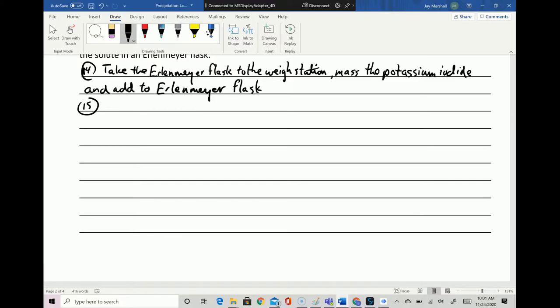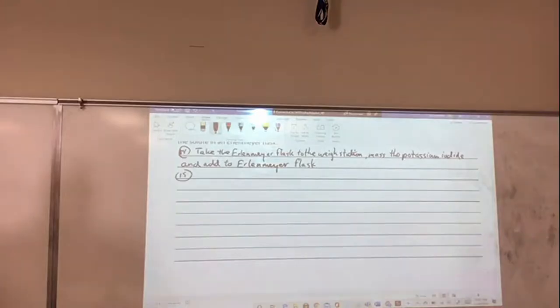With the, let's see, was it 100 milliliters of each? At least 100 milliliters. Okay. What else do you want to say, Kinsey? When you first fill the empty Erlenmeyer flask with water, well, we're filling the Erlenmeyer flask with the graduated pipette, right? We want it. No, because you had two, so that you can use the water. You can put the pipette into the water. You have two Erlenmeyer flasks.